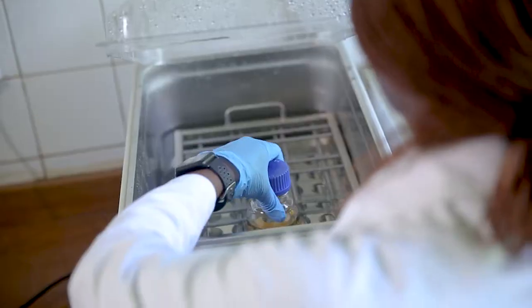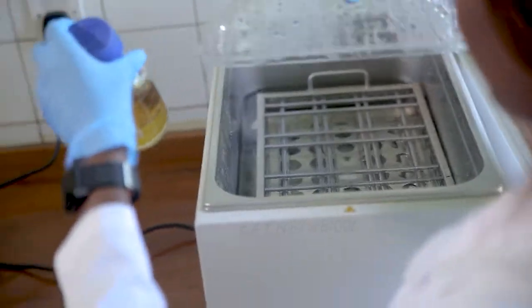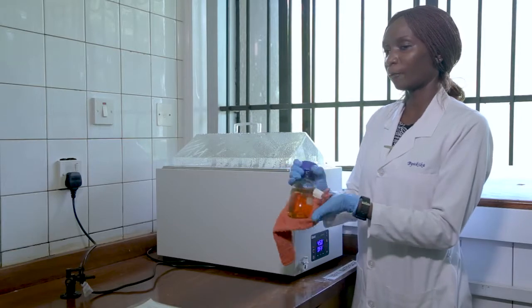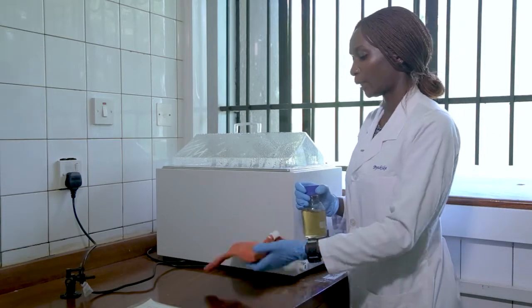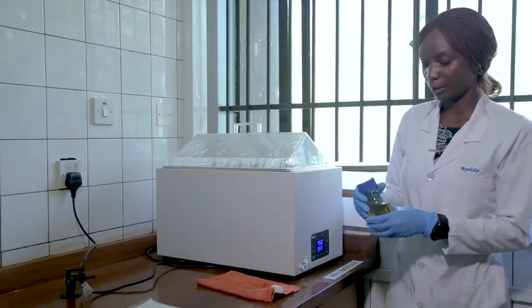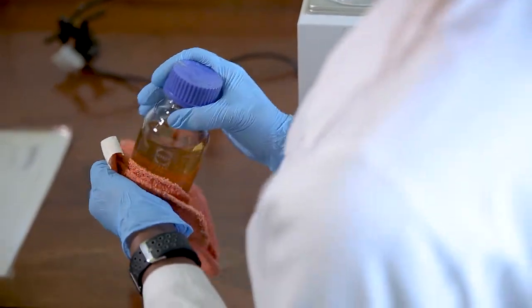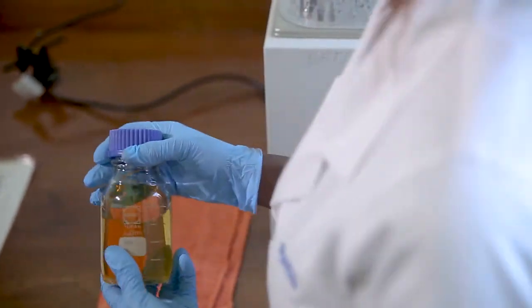So we pick up already prepared agar from the water bath. We put it in the water bath to cool, because when we pick it from the autoclave, that's usually at a very high temperature, above 100 degrees. So make sure that you wipe the bottle to remove any water that could drip into our petri dishes.